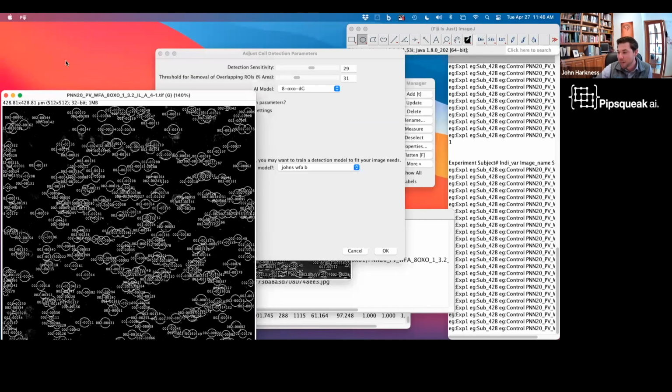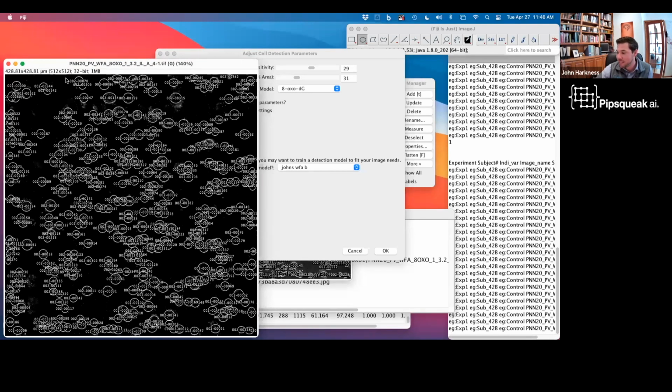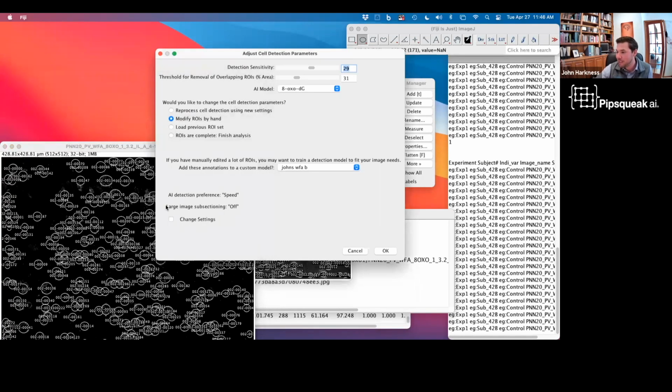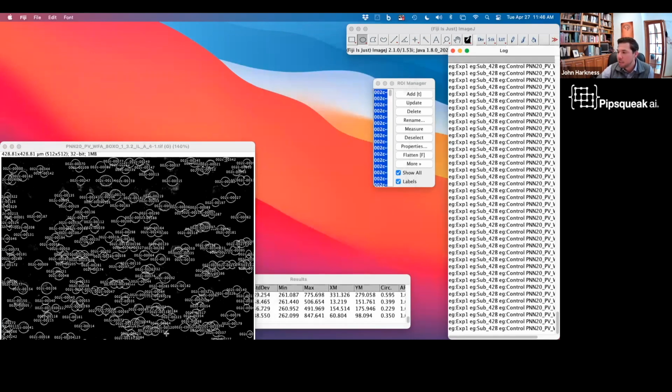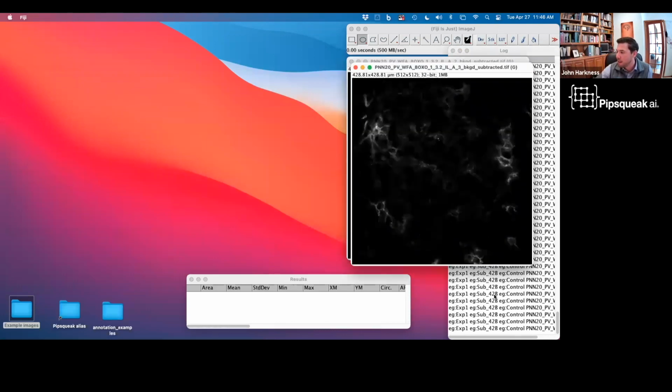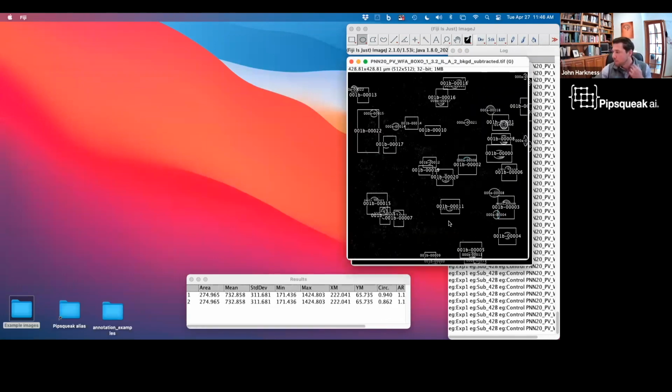And processing or annotating each one of these images takes about an hour by hand. So there's a lot of work that goes into those 8-oxo models. All right, I'm going to say it's done. But here's one interesting thing. Remember that I already put it in a WFA model, and in this case I don't want to put my 8-oxo into the WFA model. So I'm just going to go back and select no here. Now this image just isn't being added to any custom model. It's just being quantified, and I've got it there in my results.